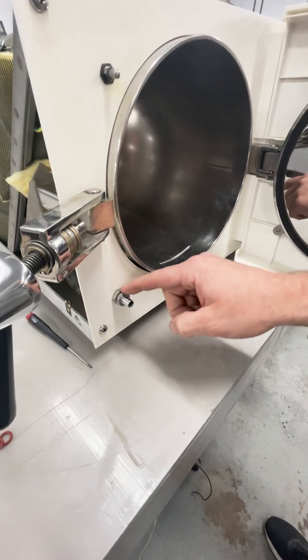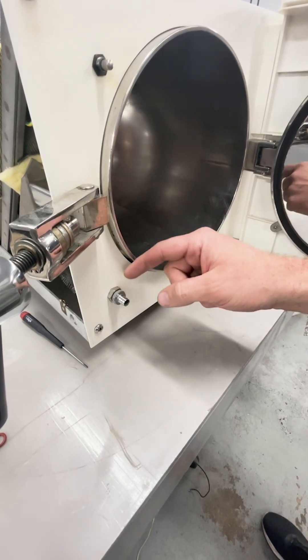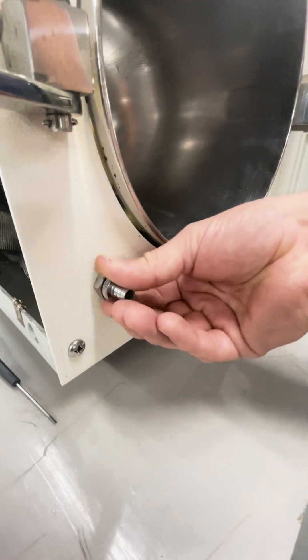Today we are changing the o-rings in a Tutanauer. These are the same for all automatic and manual EZs. First, you want to make sure your reservoir is drained or you have a bucket underneath.